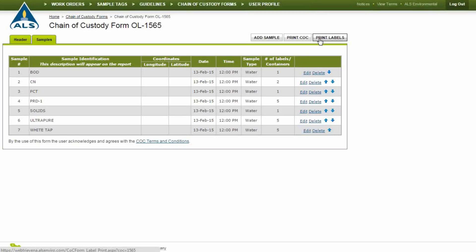For complementary label sheets, contact your ALS Account Manager. You can also create chain of custody forms by clicking Chain of Custody Forms in the top links.